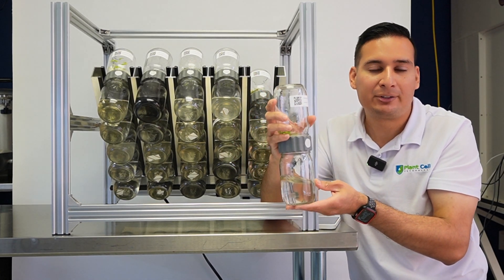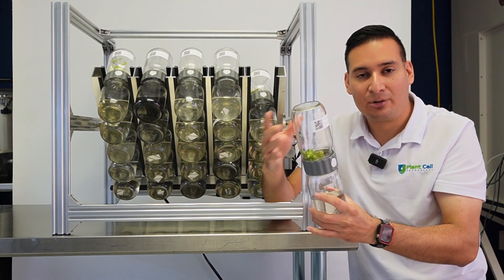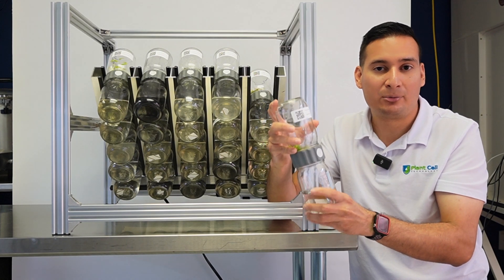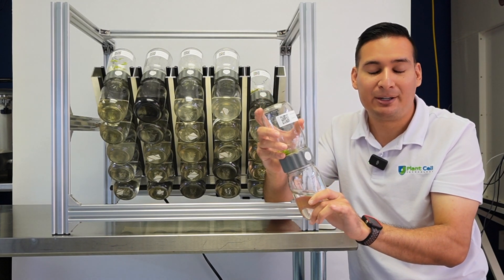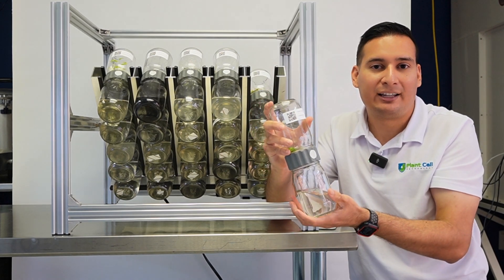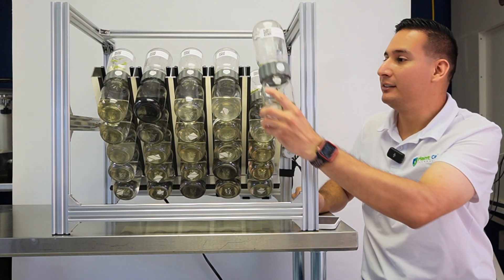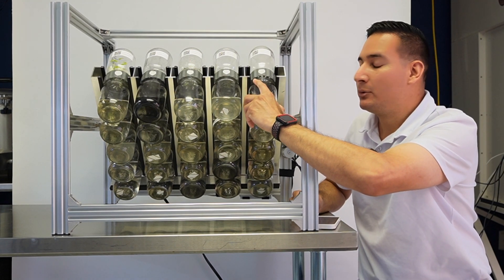The only problem with the BioCoupler is that it is a manual system. When you have one or two biocouplers it's not a big deal, but when you're trying to scale and grow hundreds of thousands of plants with many temporary immersion bioreactor systems, it gets to be a lot of work. That's where the BioTill system comes in — a fully automated temporary immersion bioreactor system.